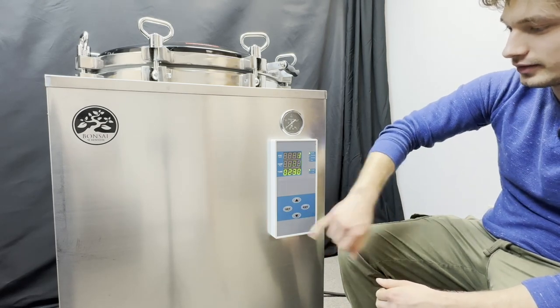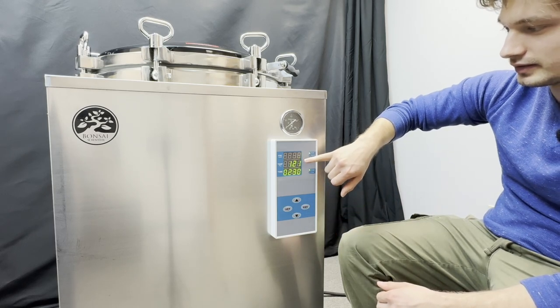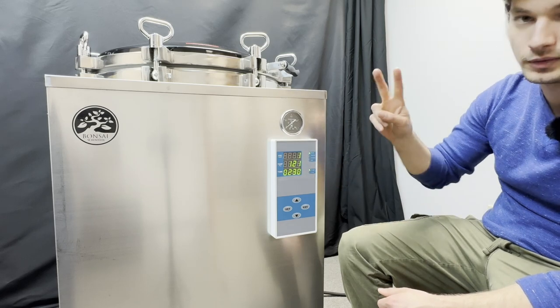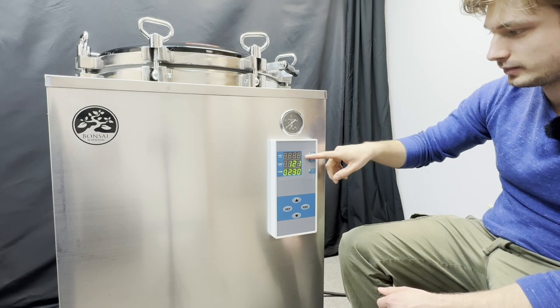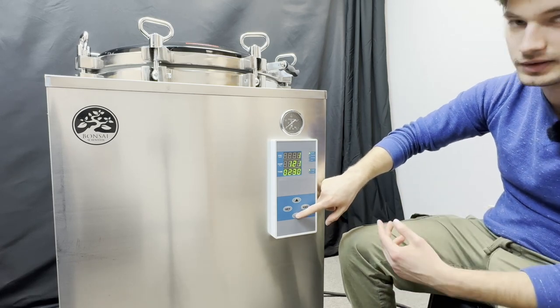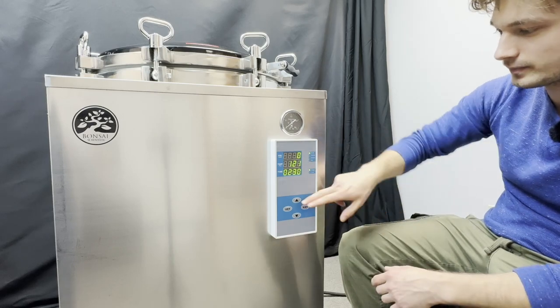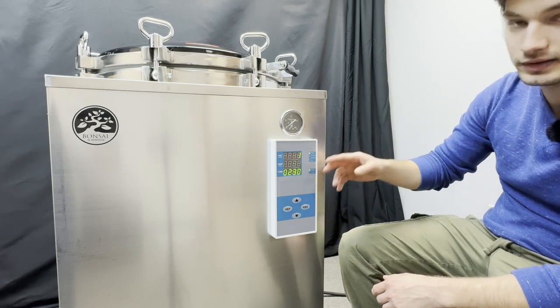To program the autoclave, hit Set until your first indicator is blinking. This is your end-of-cycle depressurization program. There are two options: one and zero. One means you want to do an auto-venting procedure that takes place over 20 to 30 minutes; zero is natural depressurization. Today we're going to do the auto-venting — hit Enter.